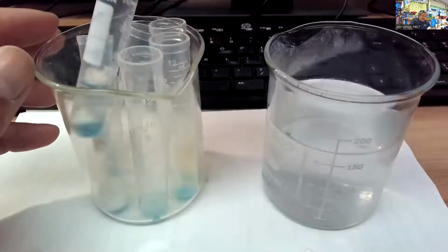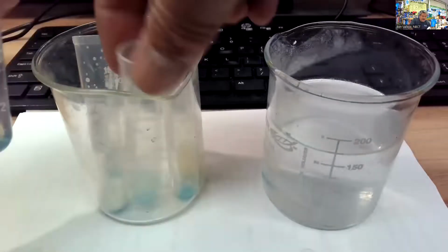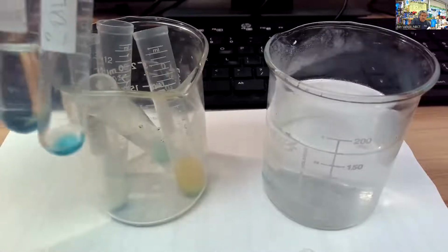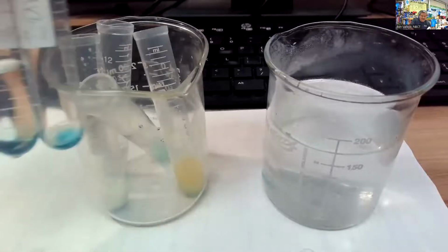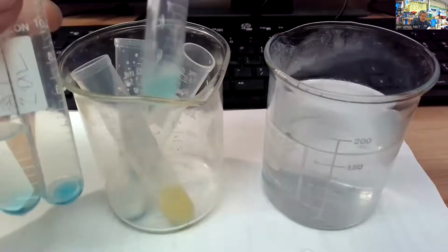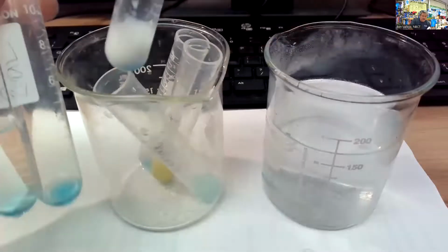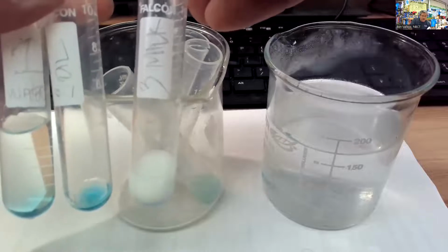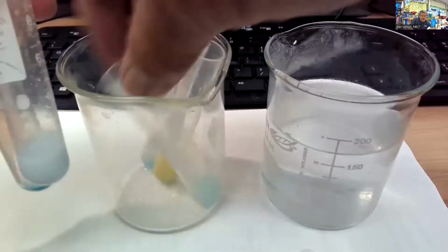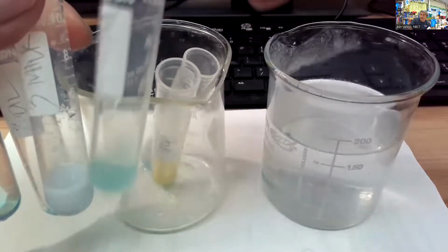Let's see. And there's number 1. You can see the color right there. Here's number 2, the oil. Okay. This is so that you can get the initial color. 3rd one is the milk. So here's the milk with 5 drops of the blue Benedict solution. All right, the 4th one is oatmeal. There's the oatmeal right there.